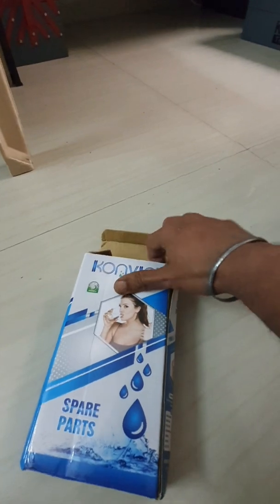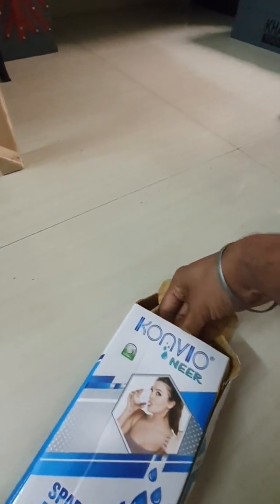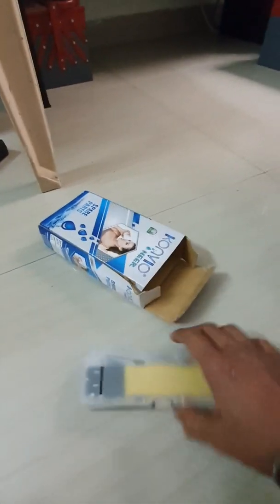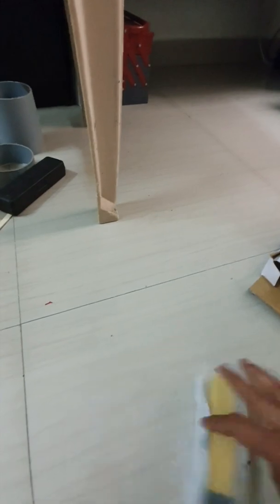Just to make sure that you have the correct pH for your plants and fish. It can be used for drinking water, swimming pool water, any kind of water. Inside the box there is nothing else — pretty much it comes in a nice plastic box.